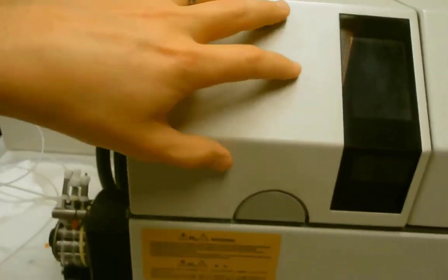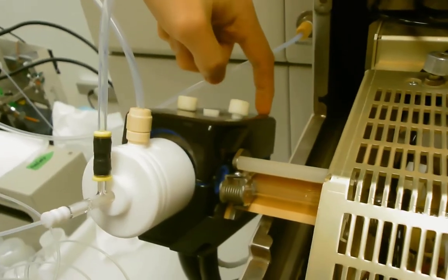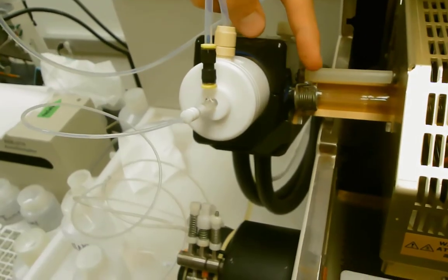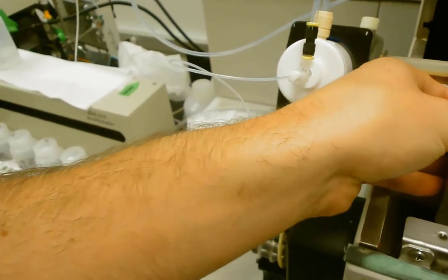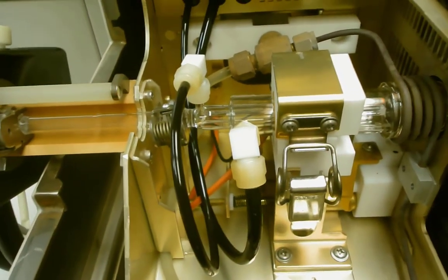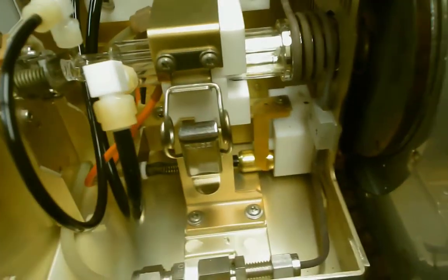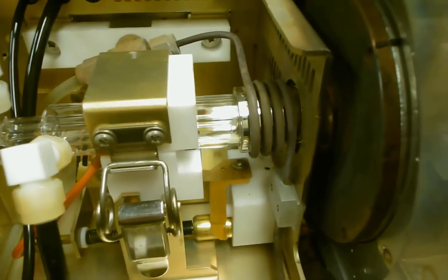And then in here is where the plasma torch is located. So the fine mist of liquid droplets will go into this quartz tube. And then I've already loosened up this cover. So it'll go through the quartz tube into the torch, and the torch takes two different argon streams. And there we go, into the quartz torch.